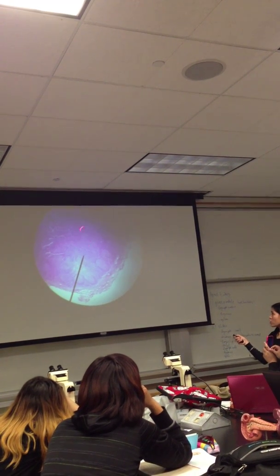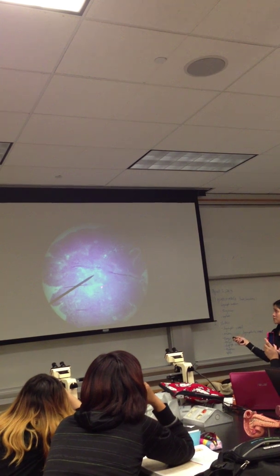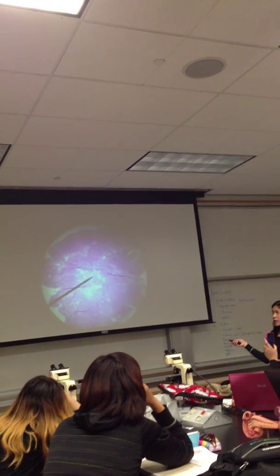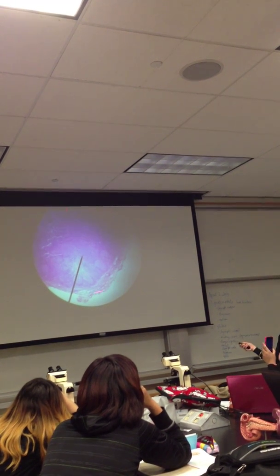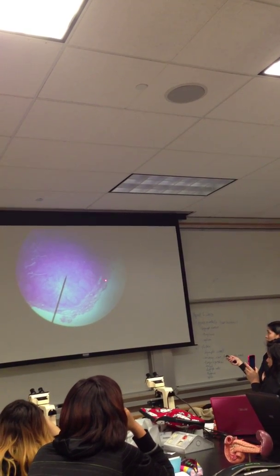If you notice, it's more dense, more closely packed compared to this, isn't it? Spleen? No. This is the lymph node. See how it has a capsule? And this is a vessel, a lymphatic vessel.